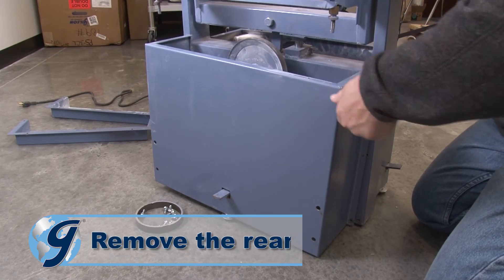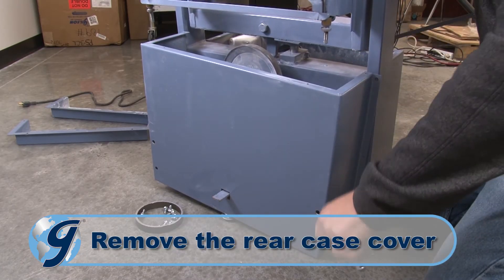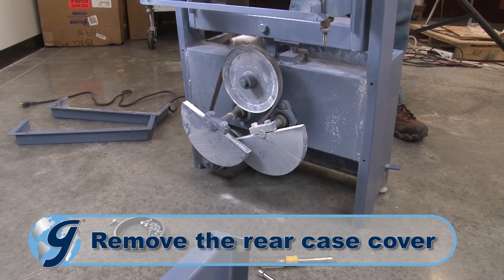Now, remove the six screws of the rear case cover and set the rear case cover and screws aside.